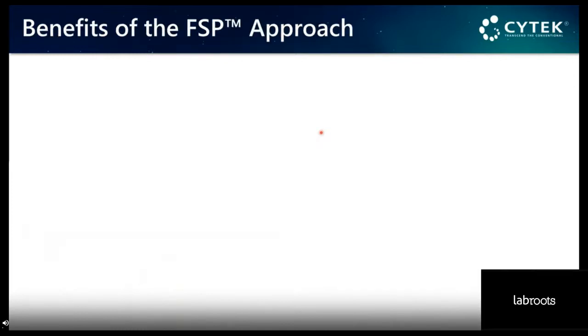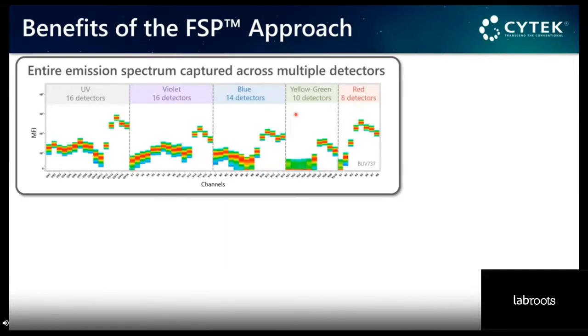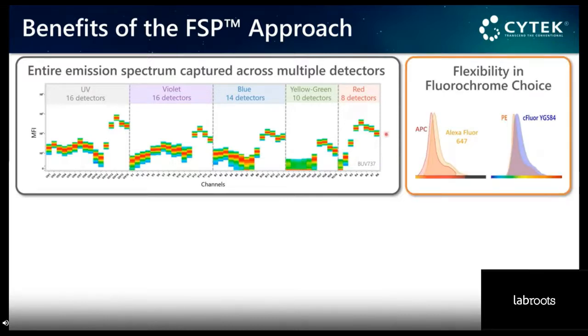What are the benefits of having that full spectrum characterization and having those specific detectors? Now we understand the samples better, understand the fluorochromes better, what their pattern of excitation and emission is. Doing that and not only focusing on one single detector, we can now use dyes that have a similar peak of emission, but their whole signature is different, and we can use them in combination in the same panel, characterizing the same cells.